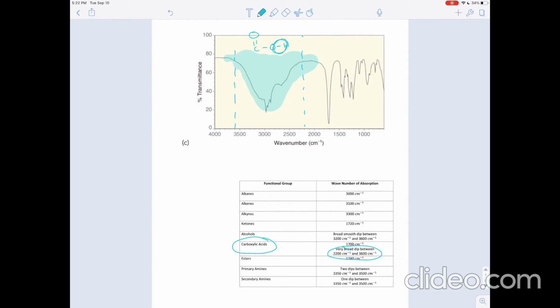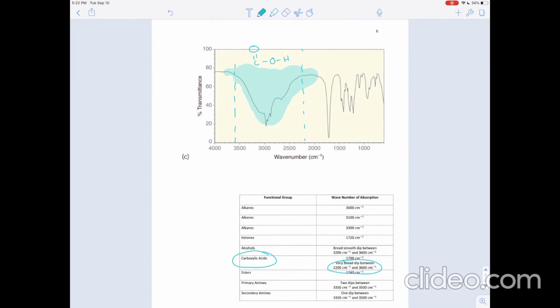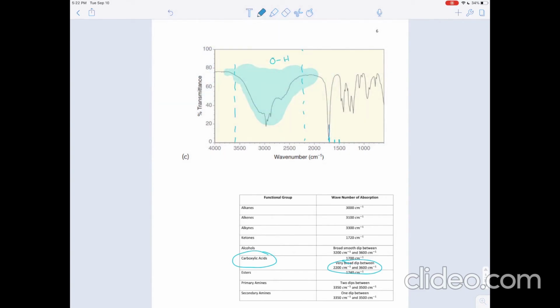This bond right here is vibrating in a different way. It's involved in so many intermolecular forces that it gets spread out. Okay, so basically it's that there. And then you'll notice we have another one. This is 1500 here, 1600, 17, around 1700, we have this next absorption.